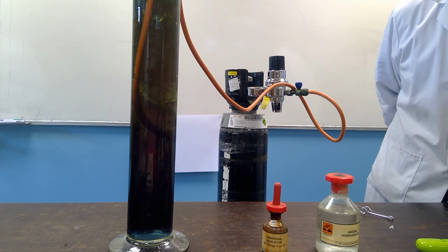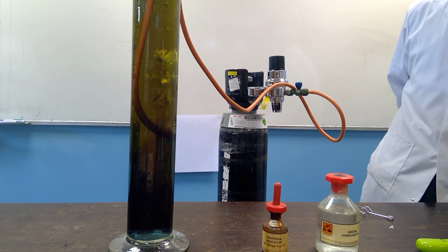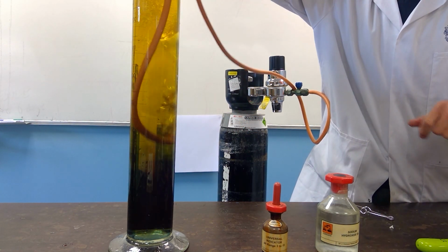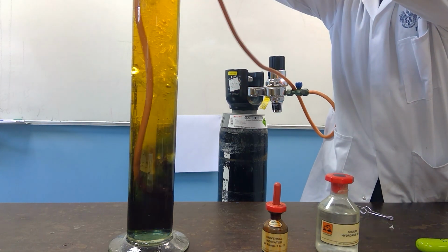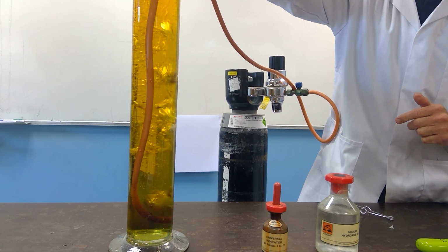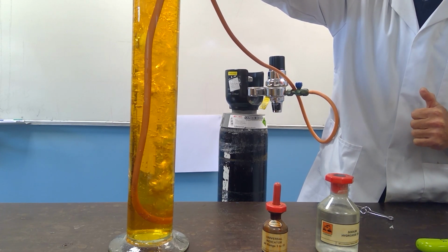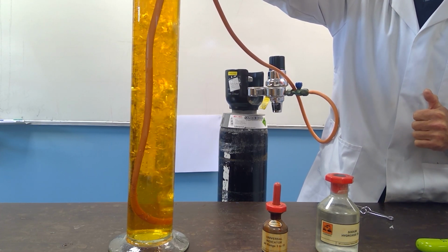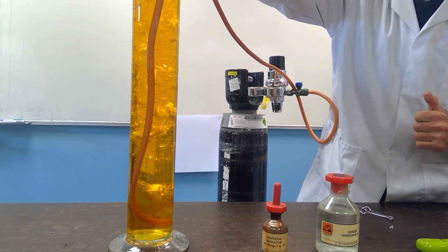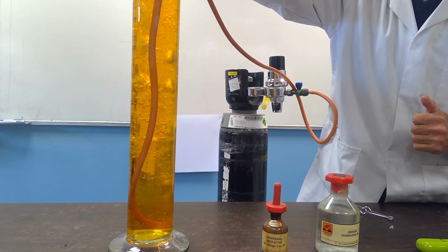Color change is about to occur. So we're heading towards greens and eventually through to yellows. And you can see that we've gone through yellows and greens, it's neutralized, and the color now is distinctly orange in color, which indicates, the universal indicator, that the pH has reached roughly a pH of around about 5.